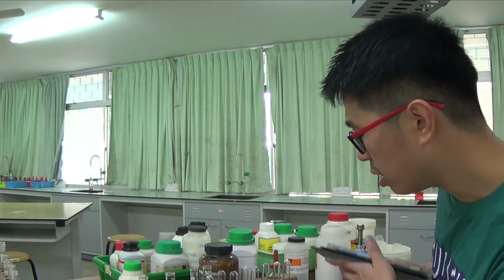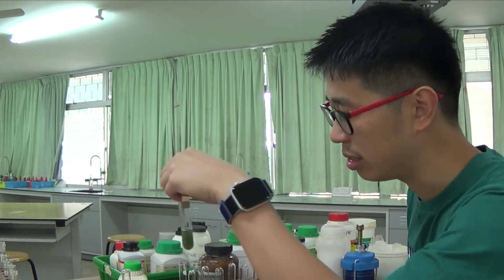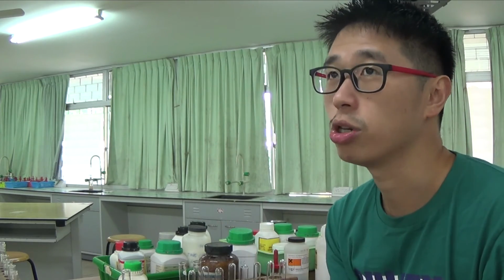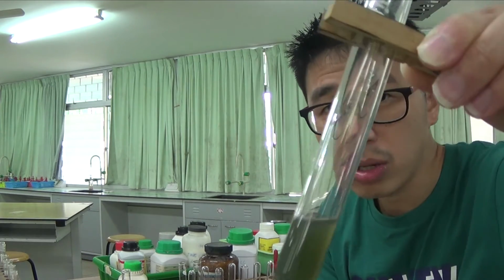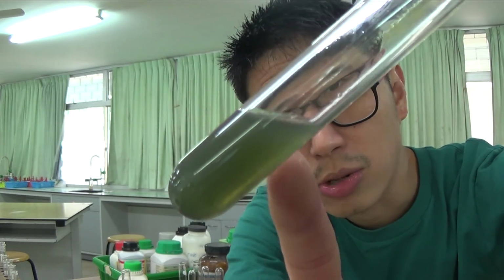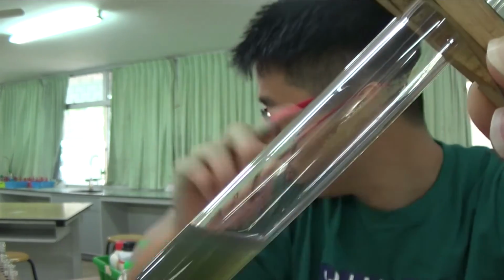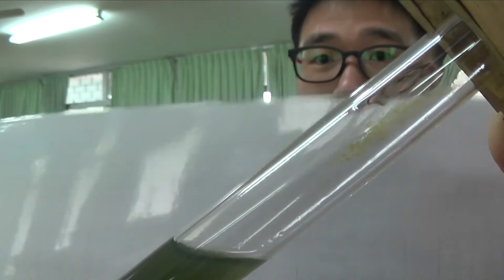Okay, there's actually another observation that you are supposed to take note of. This is usually not stated in the table, or usually not what is stated in the theory, unless you actually do the practical and you can see it. I want you to see very carefully what happened on the upper part of the tube. In the presence of excess hydroxide, a little bit of the iron 2 hydroxide on top is supposed to get oxidized. I think I mentioned in my other qualitative analysis video.